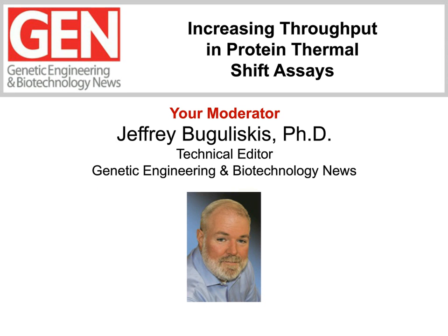Historically, protein interaction and stability have been measured using a variety of techniques, such as NMR, differential scanning calorimetry, and surface plasmon resonance imaging. Typically, these methods lack the scalability for the fast-paced drug discovery sector and often require large amounts of precious sample. Over the past several years, thermal shift assays have developed exponentially in order to provide a high sensitivity with the speed and versatility that the biopharmaceutical industry has been demanding.